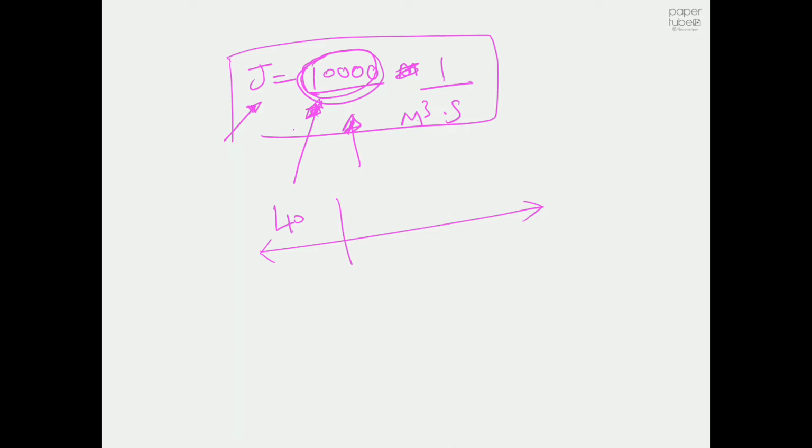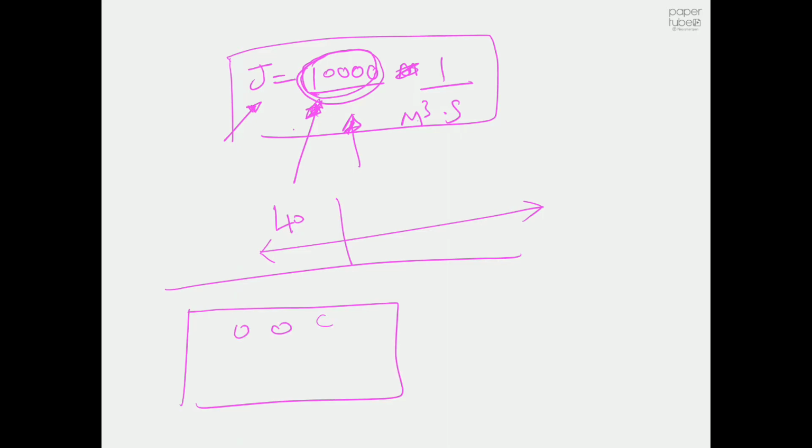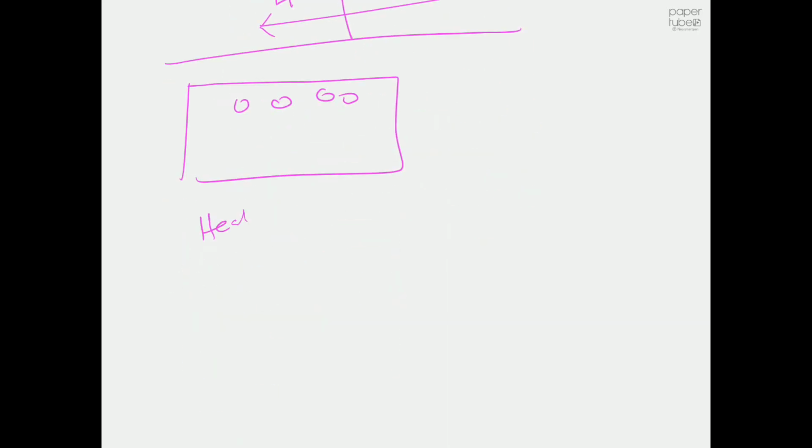So what I'm going to do is append a video of the real experiment. I didn't do the experiment, Shubangi did that experiment. So you will see her place the vials in the heating bath, and to all the vials we added the right amount of salicylamide, and then we added exactly 20 ml of our solvent, in this case ethyl acetate.